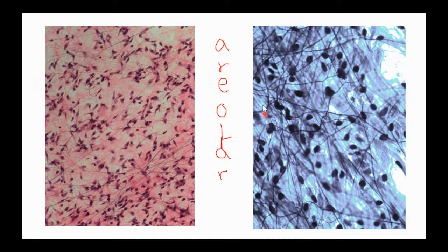When I look up really close, here's what it looks like with the yellow objective down, with low power objective. Here's what it would look like with high power objective, with blue down. So I've zoomed in a lot closer. Those fibroblasts look bigger. You can still see those proteins branching all over the place. Notice though how there's still space on the slide.